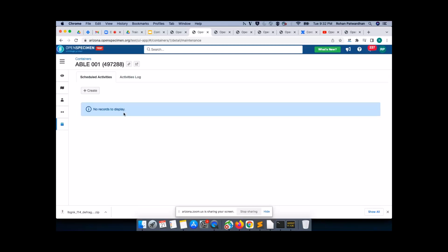And is there an indicator as to whether the user completed that task? So basically, it is the activity log, and whenever the user completes that particular activity, he can document it as a comment or something. Okay, thank you.